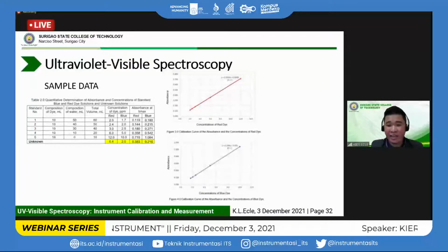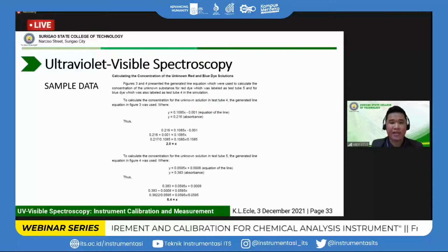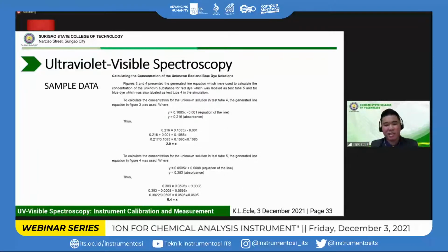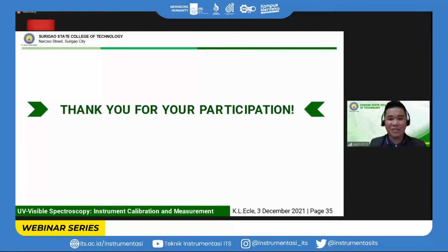The coefficient of determination is equal to 1, so that's perfect, which means the instrument is well calibrated. And the sample calculations. So I guess that's all for my presentation this afternoon, sir.